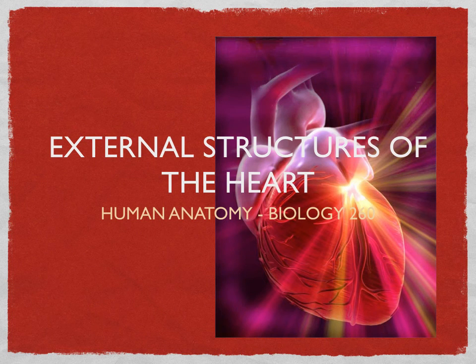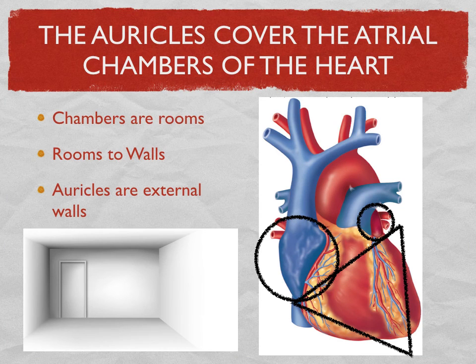Some basic things that you need are the external structures of the heart. The first thing is that we need to identify what are called the auricles of the heart. This is probably the first thing we're going to do. When you get these sheep hearts, the first thing we're going to do is identify the auricles.